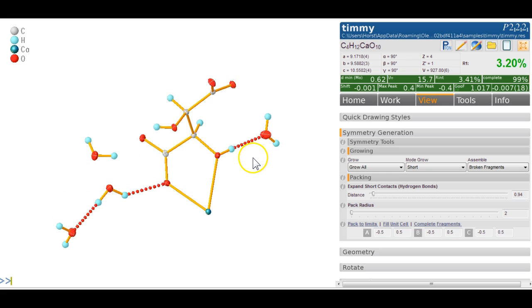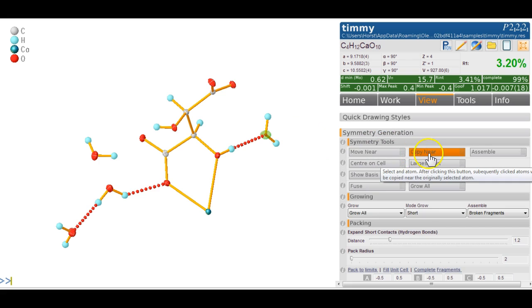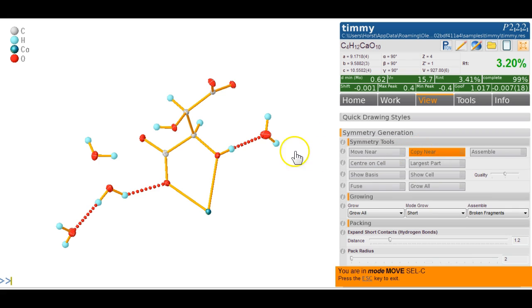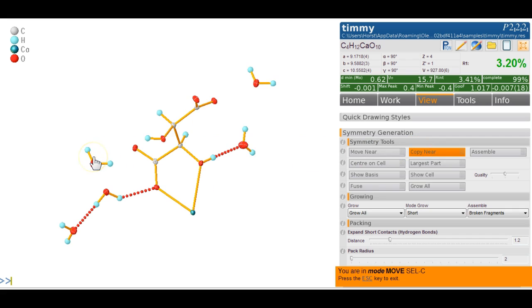Another little tool people are generally not aware of: if you wanted a symmetry equivalent position of this water molecule somewhere else, you click on this, go to symmetry tools, then copy or move near. In this mode I can click on this and it will try to copy it as close as possible to the other one. This is a duplicate now. I could have gone move, in which case it would have moved it from there to there.